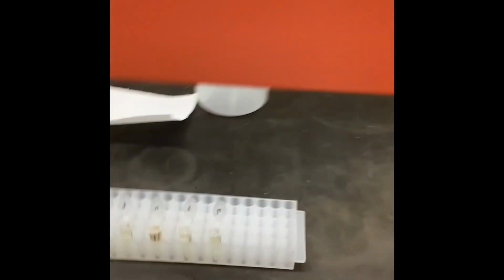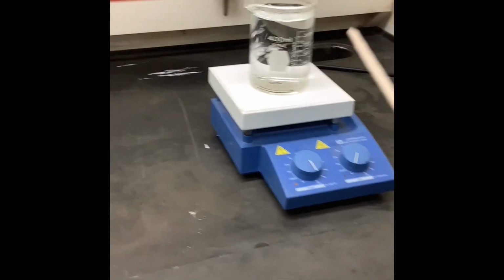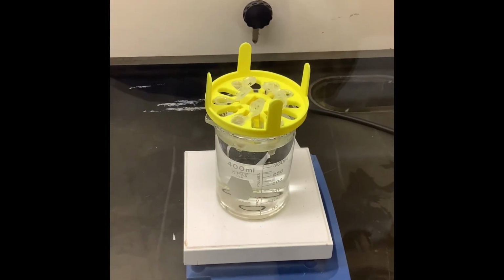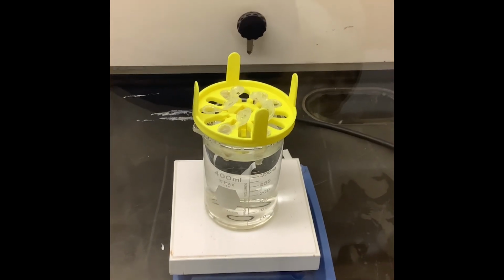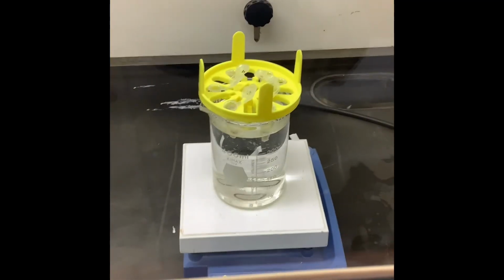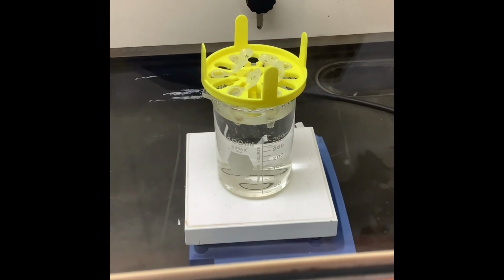Then you're going to take one of these wooden stir sticks. You're going to push the cotton to the bottom of the tube, and then we're going to put it into our boiling water bath. So here are the samples in the water bath. Hopefully by the time you're doing acetolysis, we have a bigger beaker. This one's a little bit too small, as you can see. But we're going to want to let the samples sit in there for at least 10 minutes.